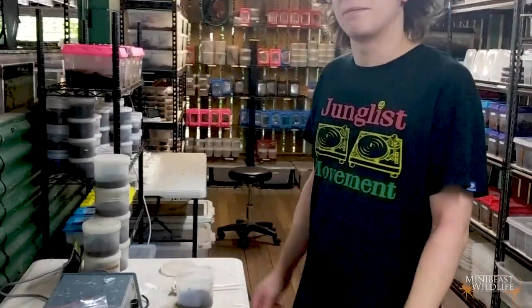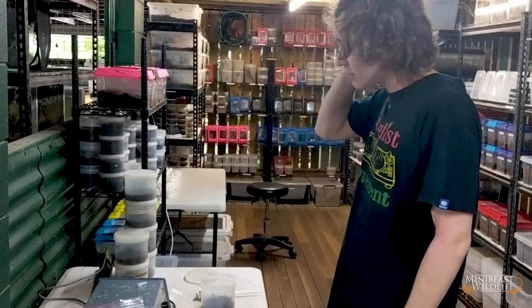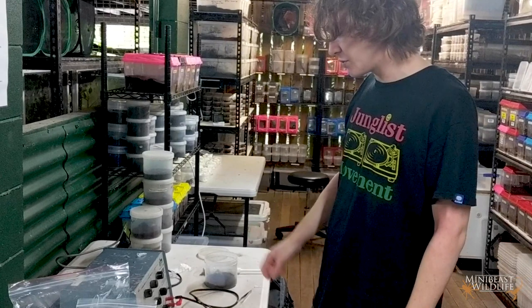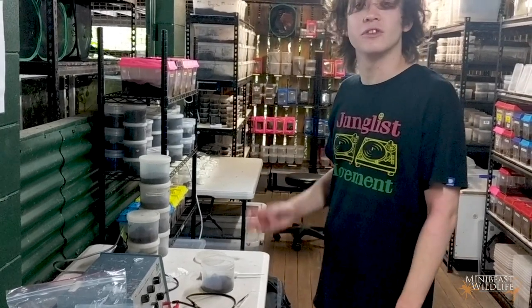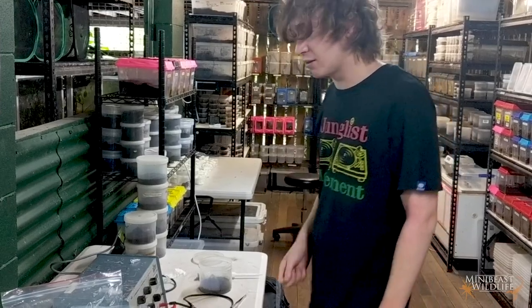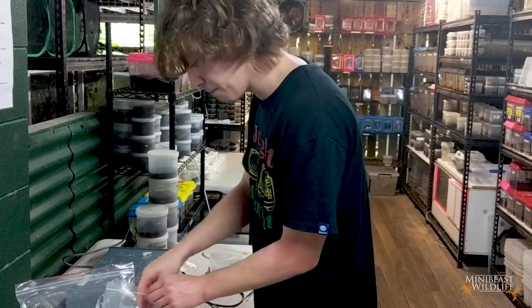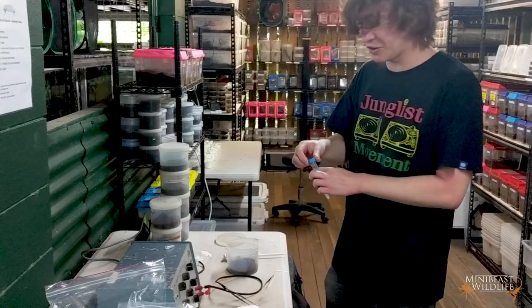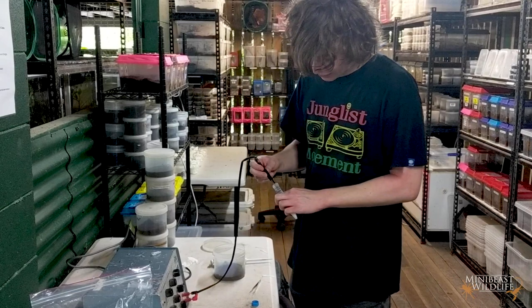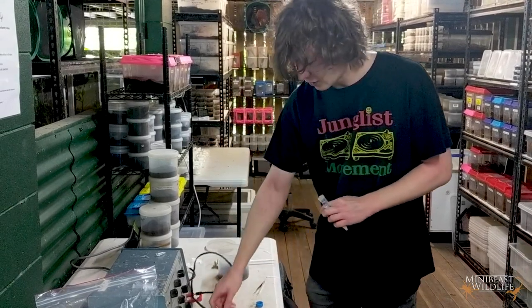What we're going to use is this electrostimulation device. We just pass a small electrical current through the tail of the scorpion — the tip of the tail — and what it will do is contract the muscle around the venom gland and get it to expel its venom into a pipette. We'll use some saline solution to improve the contact with the tail.